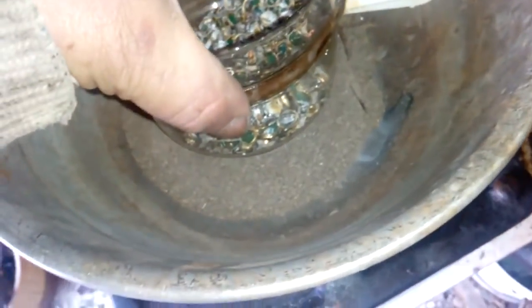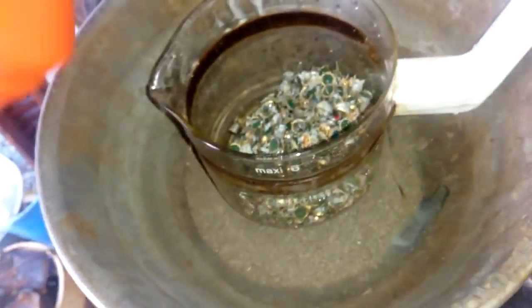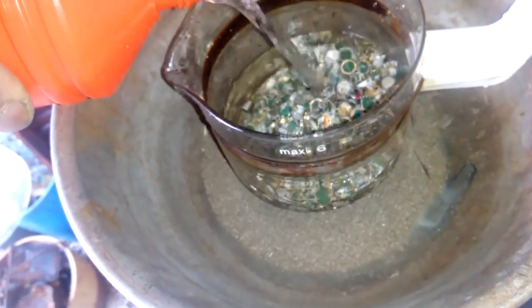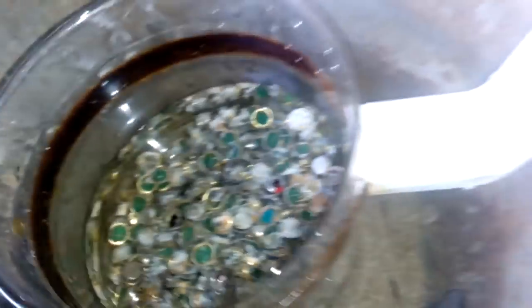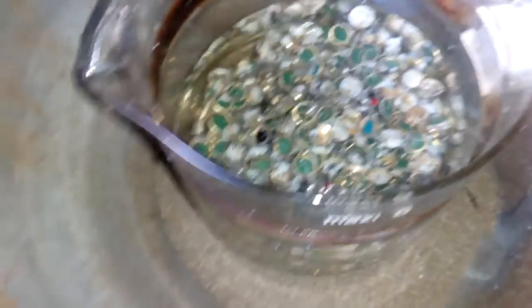Let's start. So we got our catch pan, we got our sand, and let's add some HCl. Not much. And make that on free. We will cover that and leave it.